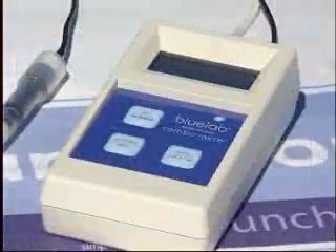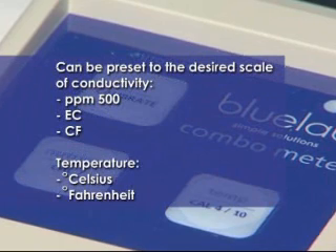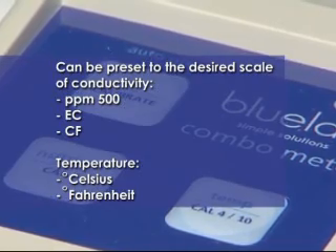The Bluelab combometer can be preset to the desired scale of conductivity and temperature. For conductivity you may select either PPM 500, EC and CF scales. For temperature you may select either Celsius or Fahrenheit.